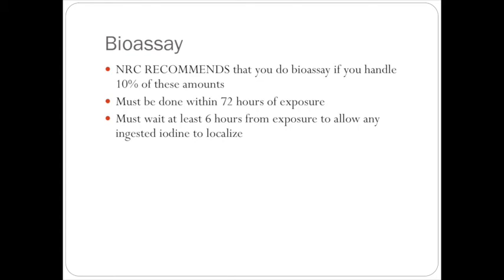So that's where our 6-hour limit comes from. So if you do have an exposure, we wait a little while, then you come back and you can do a bioassay. If you know you have a spill, we'll probably do multiple bioassays over a very short period of time to see if that starts trending upwards.